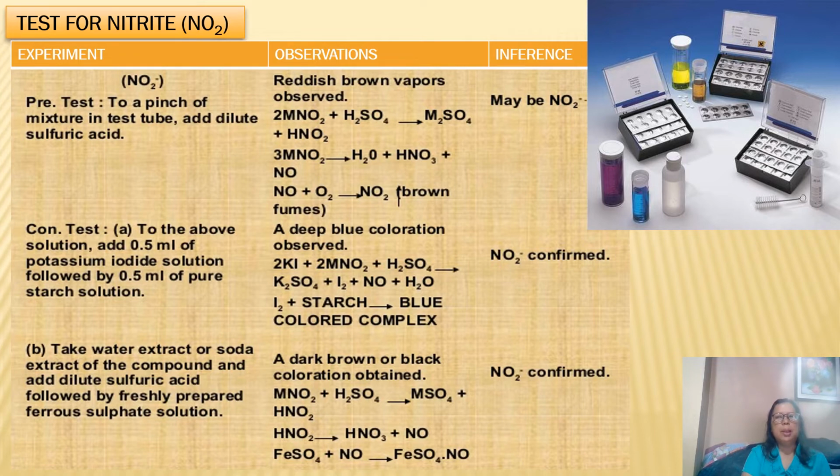In field analysis class, we do not bring any more test tubes. These are actually vials that could substitute the role of the test tube. In fact, these are prepared containers for sampling because there are already some graduation levels here to say whether the sample contains 2 ml, 5 ml. These are calibrated. Usually, these vials here are calibrated.